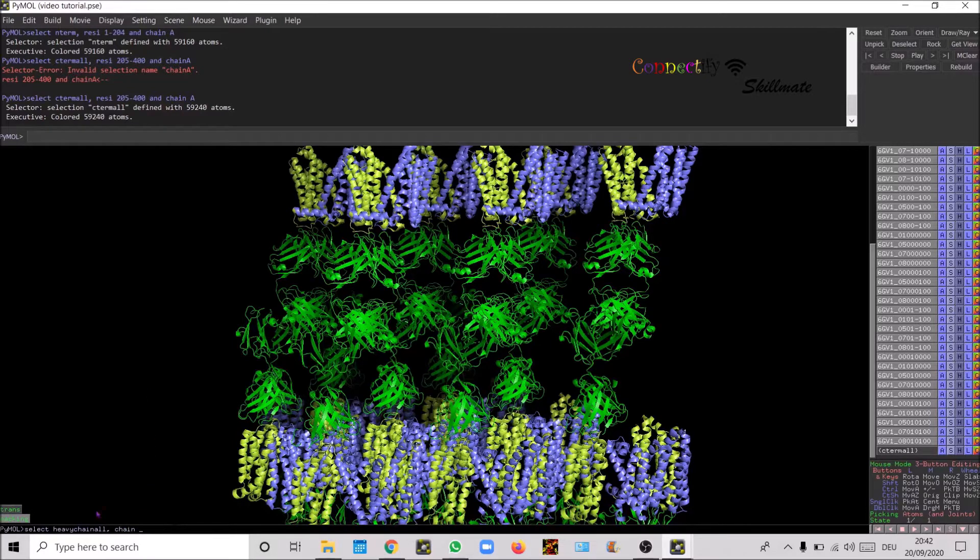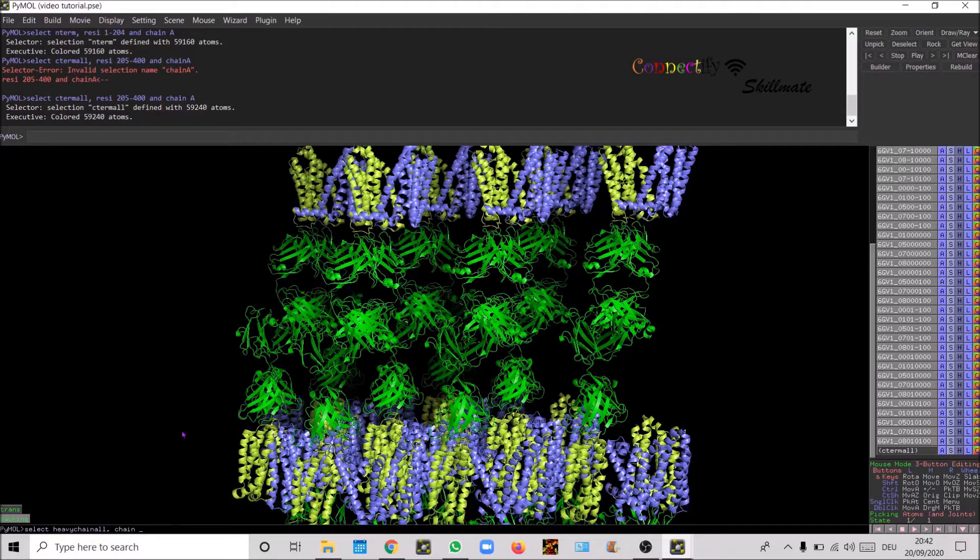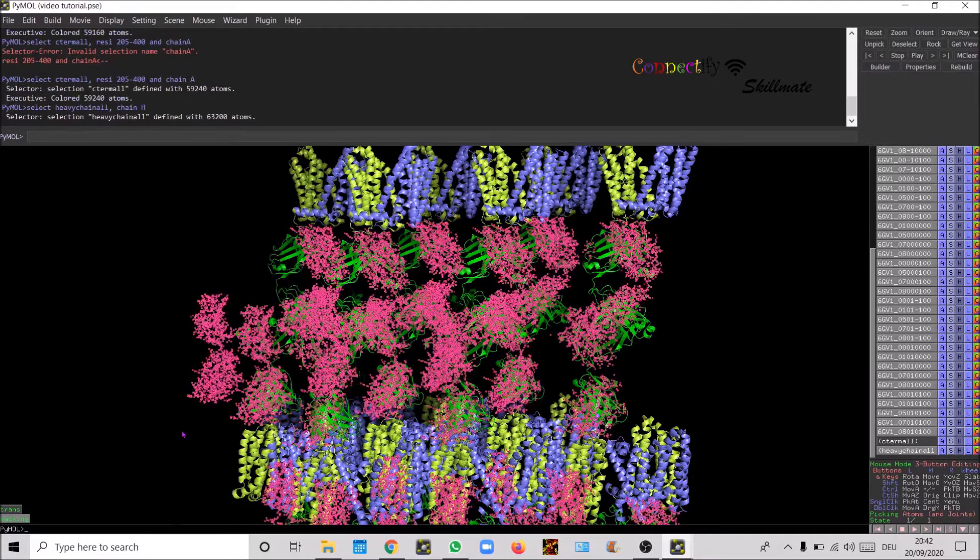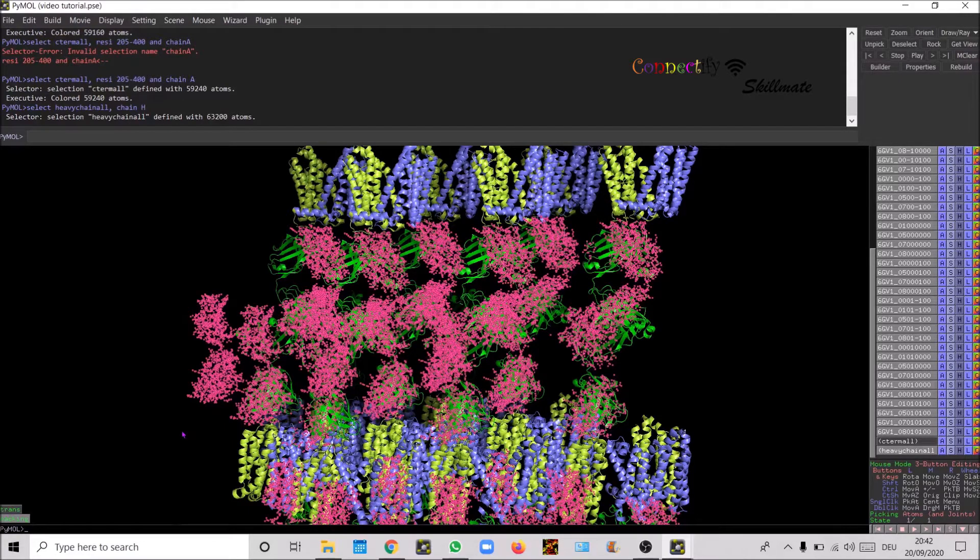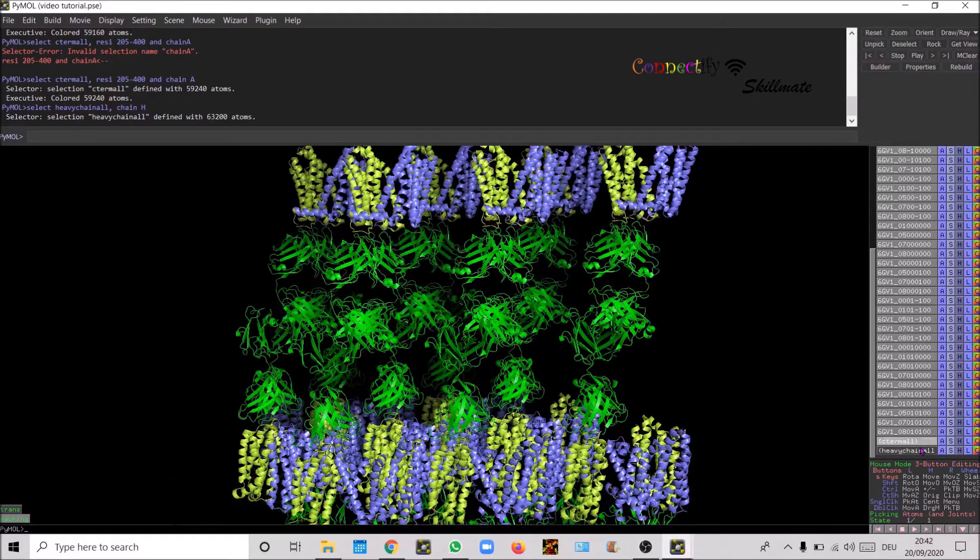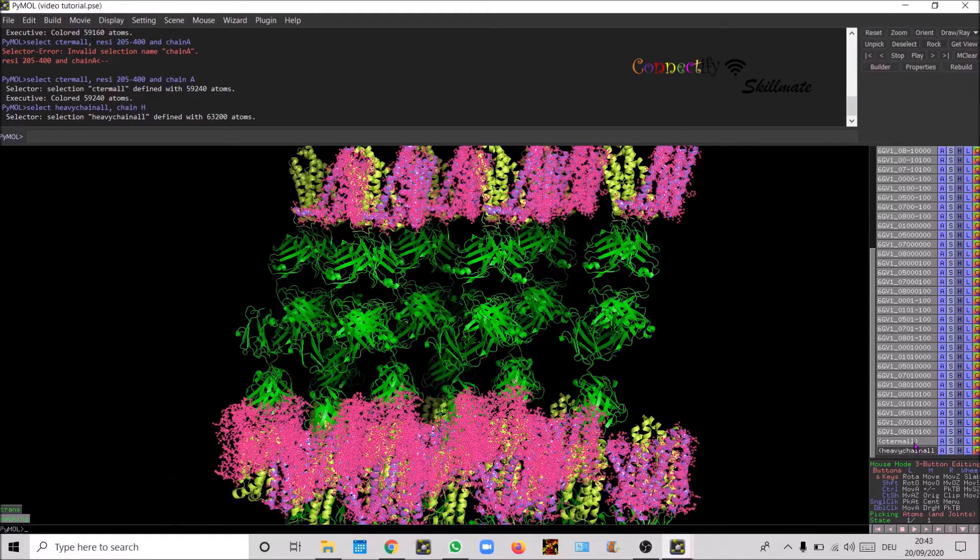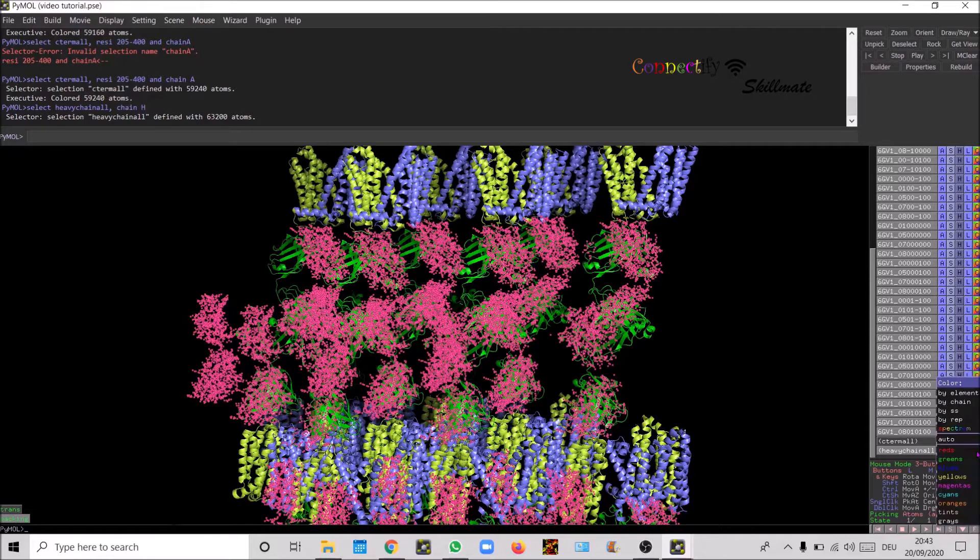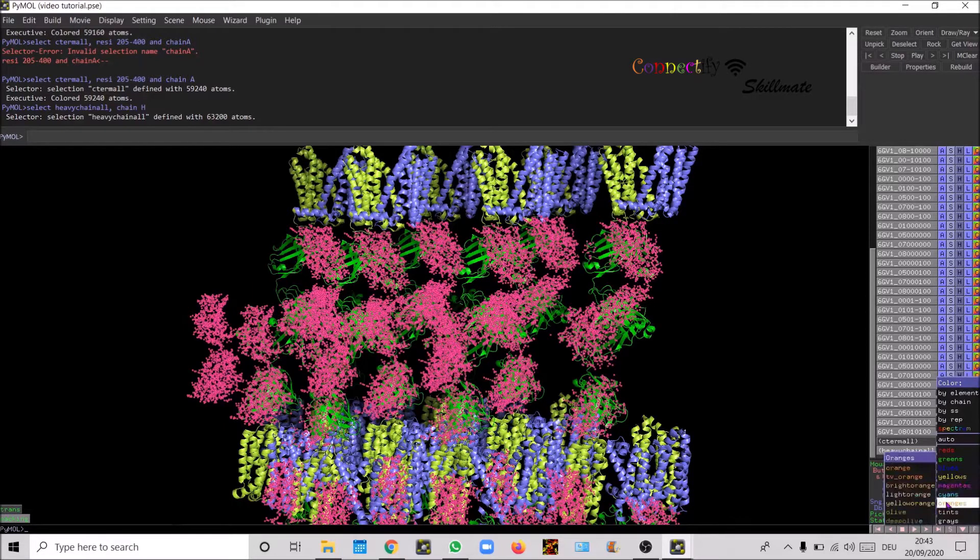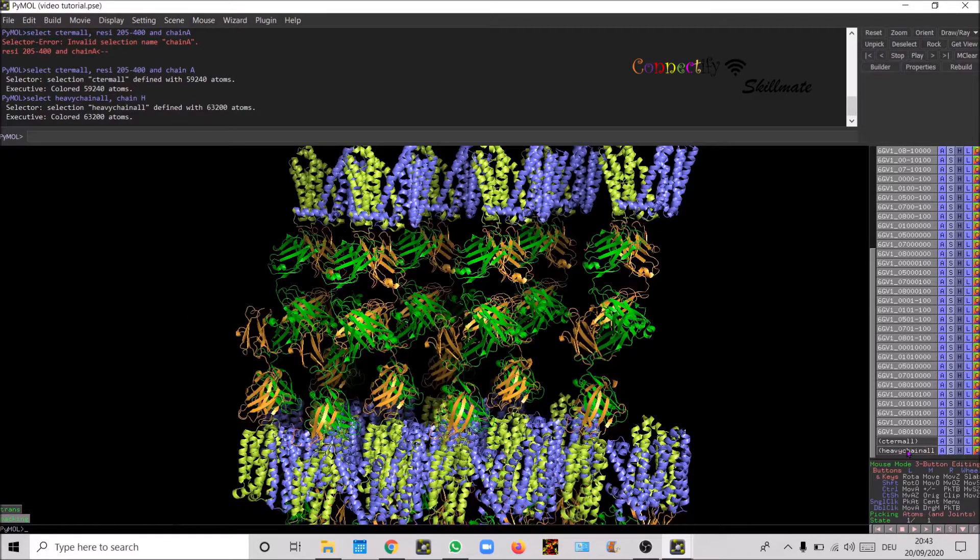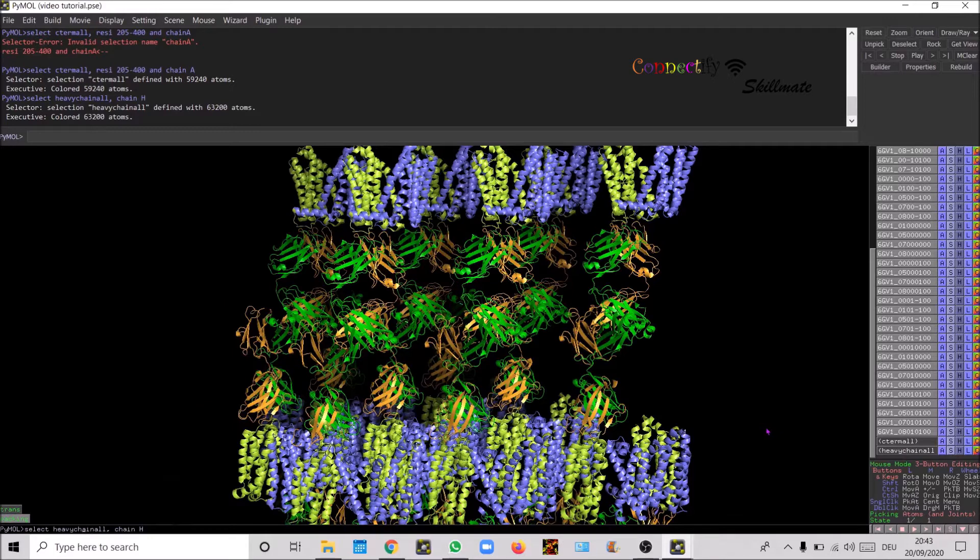This would then define the selection for all the heavy chain or the light chain for part of the fab fragment. Now it's heavy chain, so this would select all the heavy chain part of the fab. Let's see, turn, and let's say I'm gonna give this bright orange. Now the heavy chain has been changed to orange.